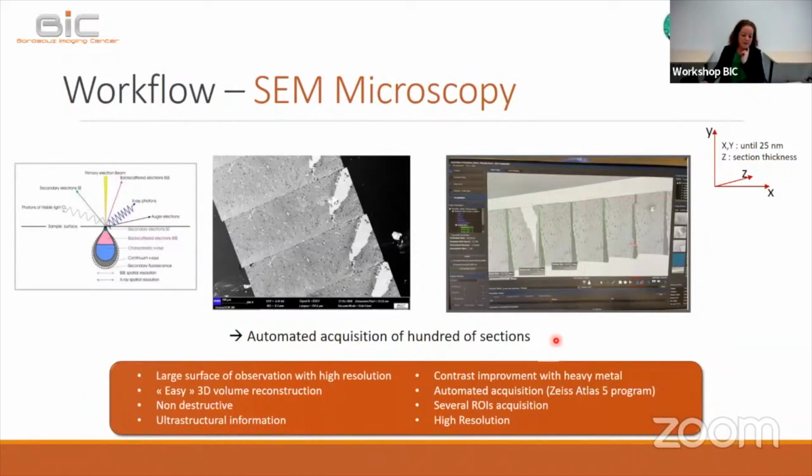It's non-destructive because you keep all the sections after observation. You can come back after if you want to select another region, or if you have a problem, or if you have detected that something is better in another part of the slice, or anything else, and it's okay.